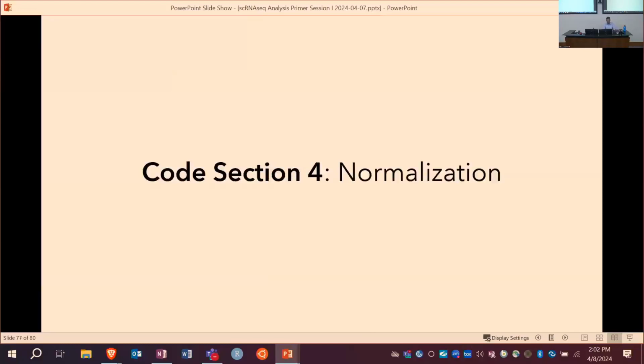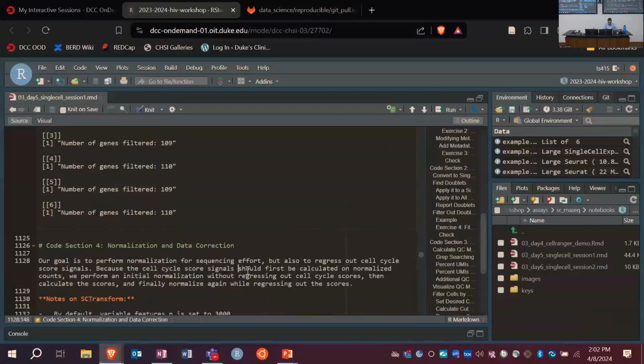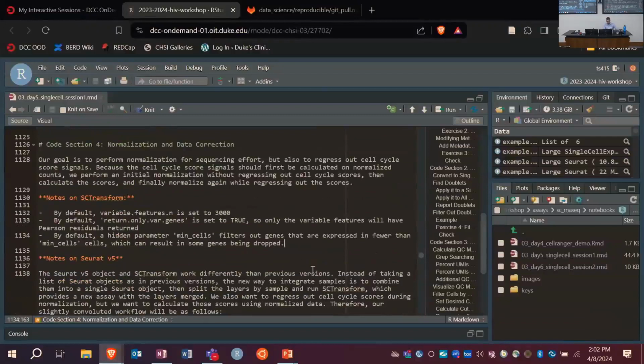Okay, great. So let's hop over to the section here. I do have some notes here in the code.